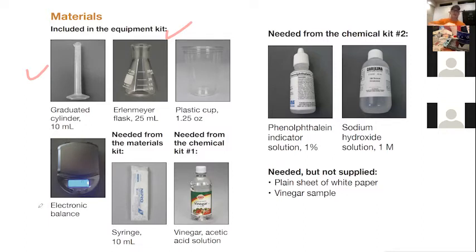You're going to need the syringe. Hopefully everyone's found the syringe, and you get some vinegar. Need it, but not supplied. Some kind of vinegar sample. Pretty much the only vinegar that won't work is red wine vinegar for more or less obvious reasons.